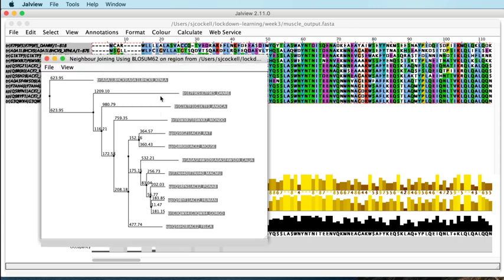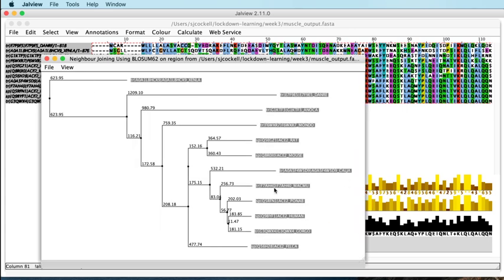So now the tree's a little bit more informative, and shows us the relationships between our ACE sequences, and that they are, to be honest, what we would expect. The Xenopus sequence, which we have now included successfully today, and was included as an outgroup, is indeed an outgroup in the alignment.